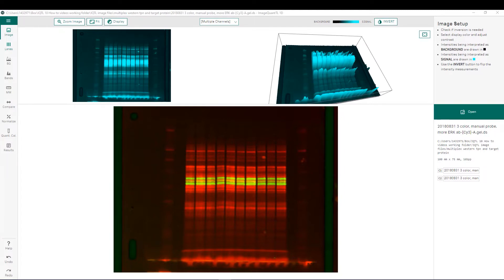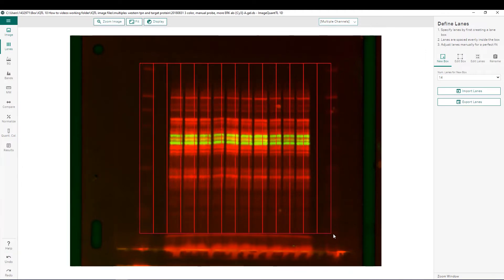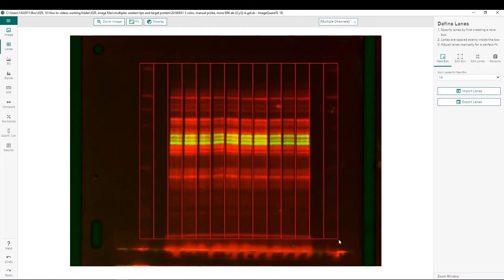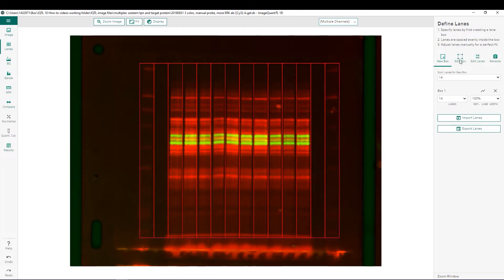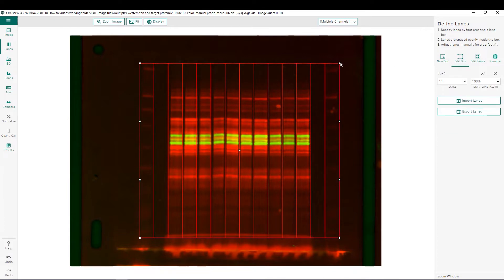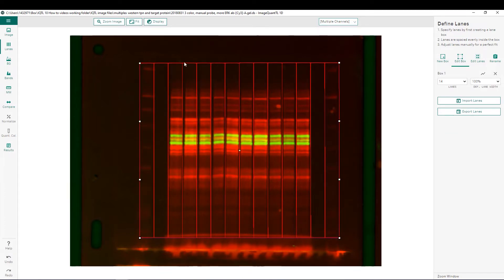Our next step in the analysis workflow is creating our lanes. This process has been covered in detail in other videos, so I'll quickly go through it here. We can choose how many lanes we would like, then click and drag from one corner to the opposite corner. We want to make sure we are not including the dye front at the bottom. You can then use the Edit function to adjust the four corners of the box to make sure it fits well.